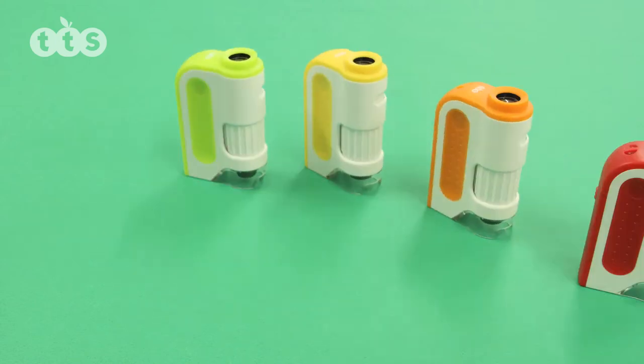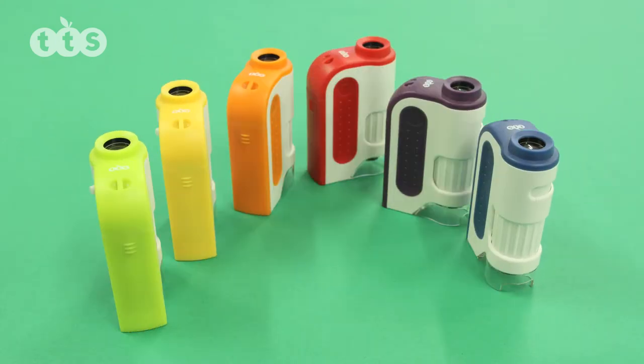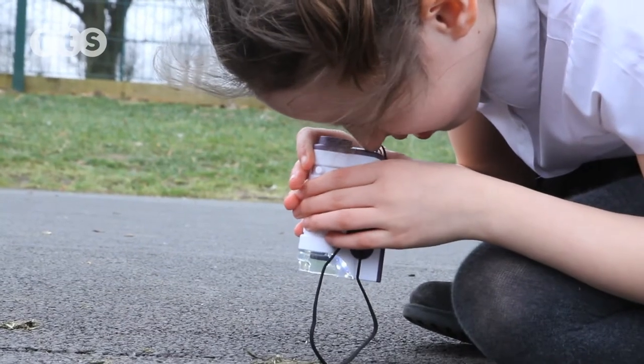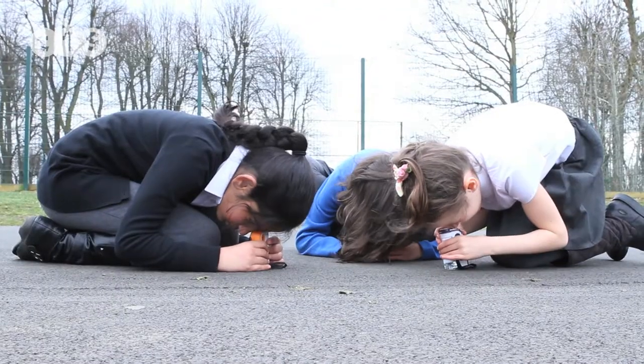Pocket microscopes are simple handheld devices, not requiring a computer or other technology. They come as a set of six, in bright colours for easy identification.